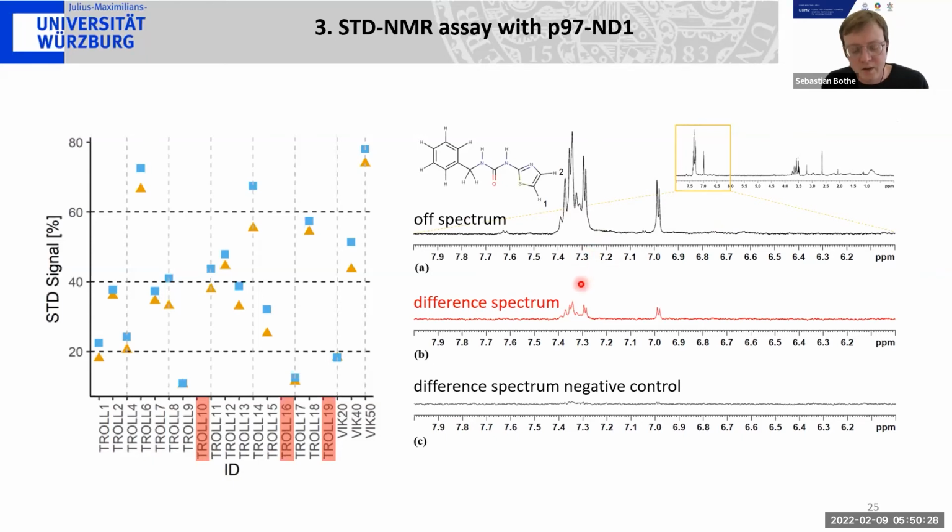And when the ligand is bound to the protein, of course, there is magnetization transferred to the ligand, and then we get a signal in the difference spectrum.